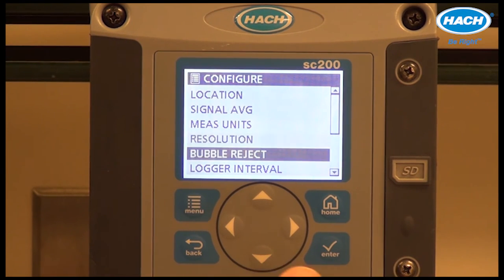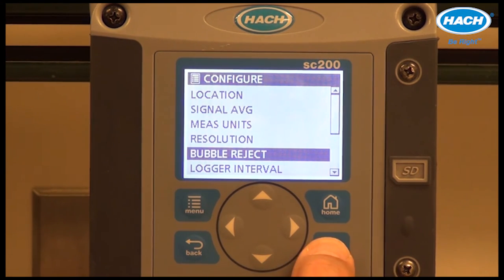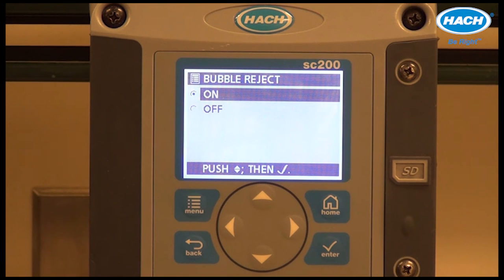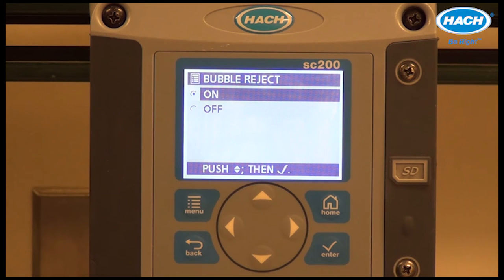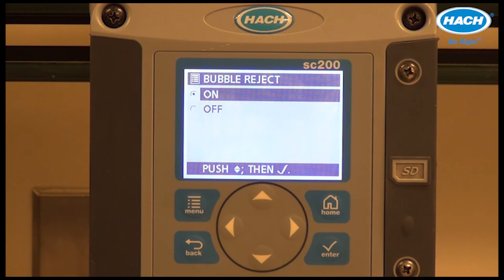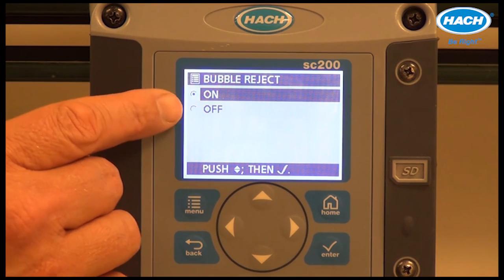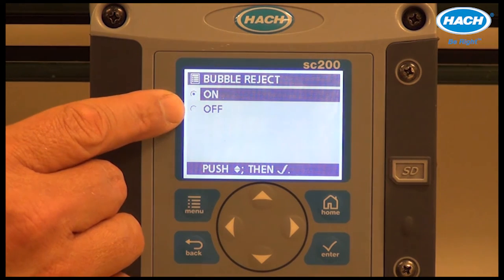Bubble reject is a software feature utilized to discard small anomalies caused by bubbles flowing through the flow cell. The default selection is on.